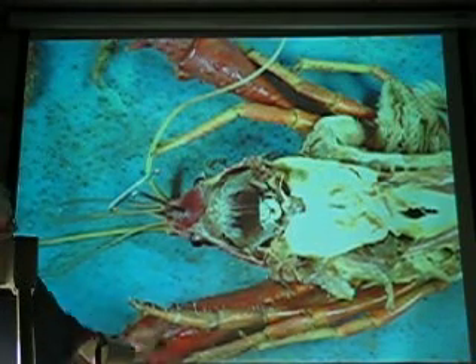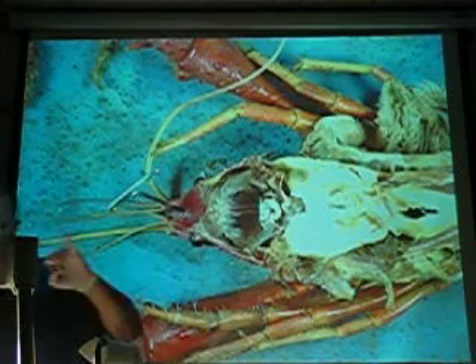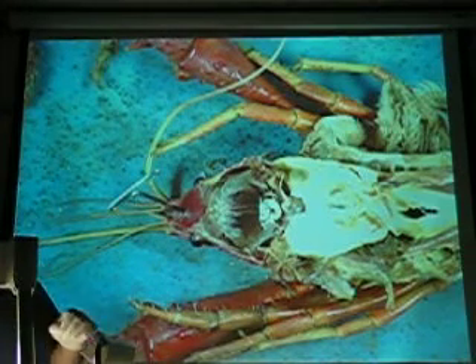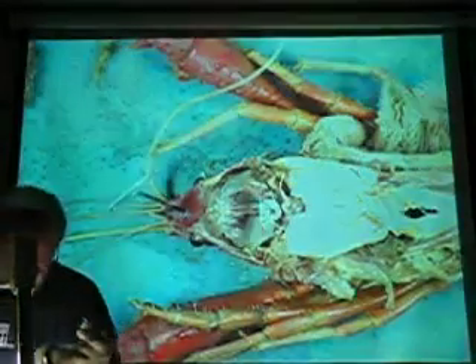And then right at the end... there's a little knob right there. Suprasophageal. Suprasophageal ganglia. Suprasophageal ganglia.